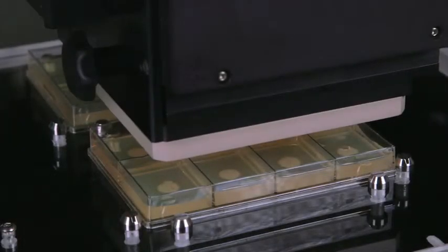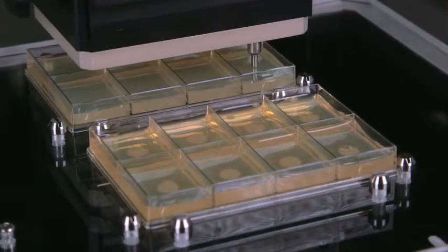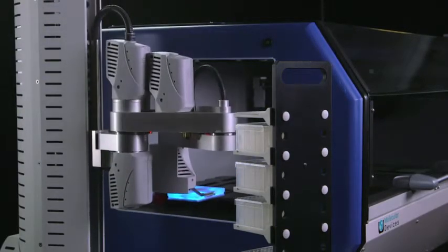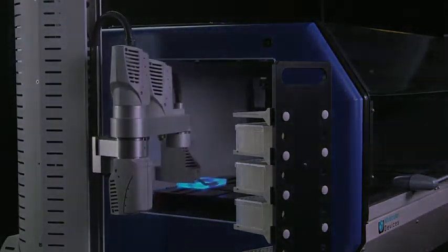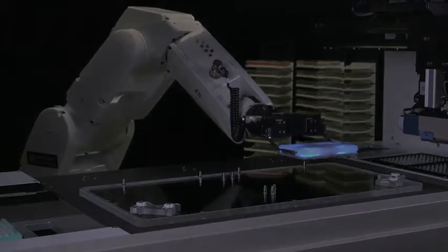Finally, before we summarize the QPIX 400, we think it's important that we grow as your assay requirements do. With that in mind, you can purchase a solution for today, and then as your assay requirements change, we can customize your QPIX through our custom solutions team. For example, we can integrate third-party robotics, incubators, and liquid handlers.